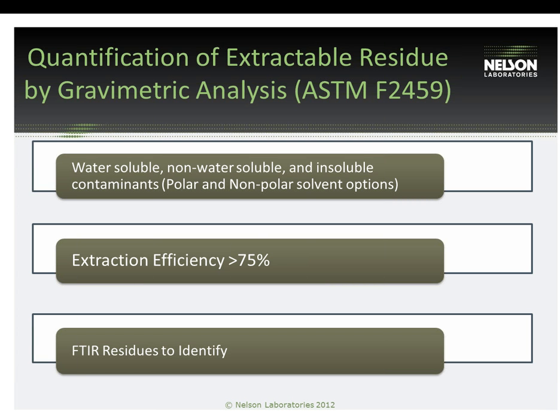We remove the device. We evaporate off the remaining solvent, and then we're left with those surface residues, and that's what we weigh and quantify and report out with the final report. With this test method, it's also a requirement of the standard to determine the extraction efficiency. What the extraction efficiency is, it's a control with the test method to show that it's effective at removing the residues from your device.